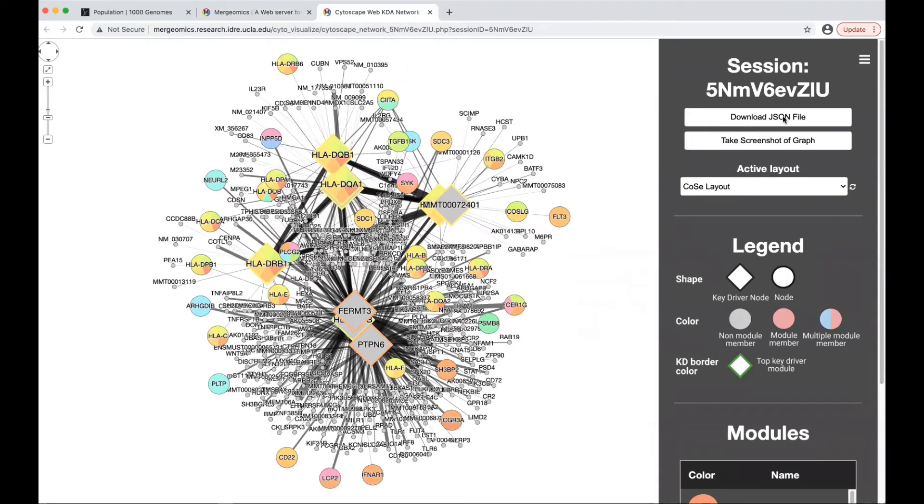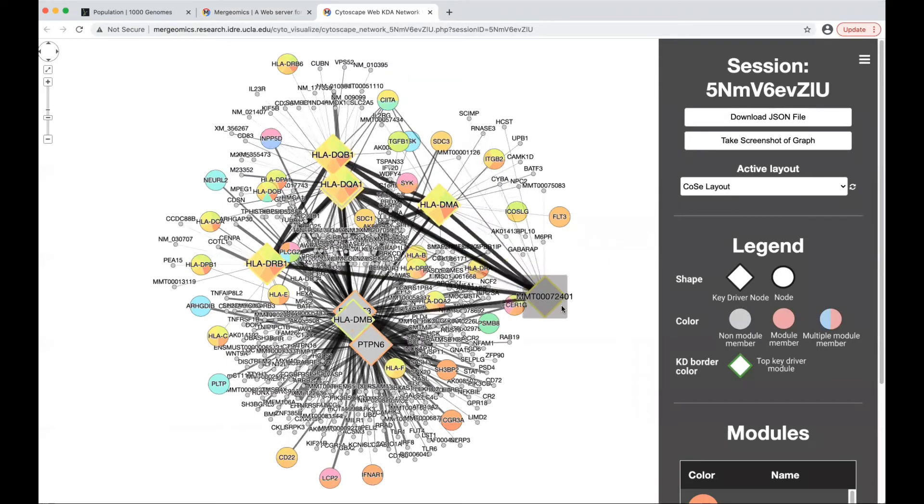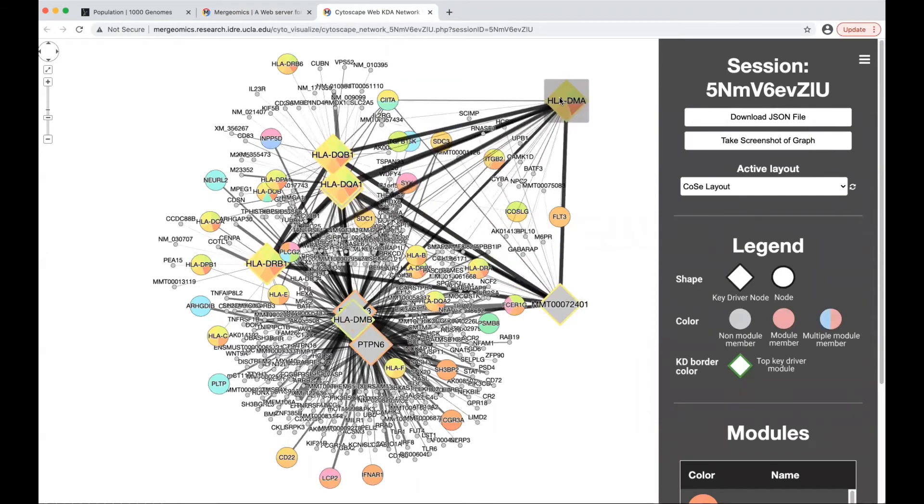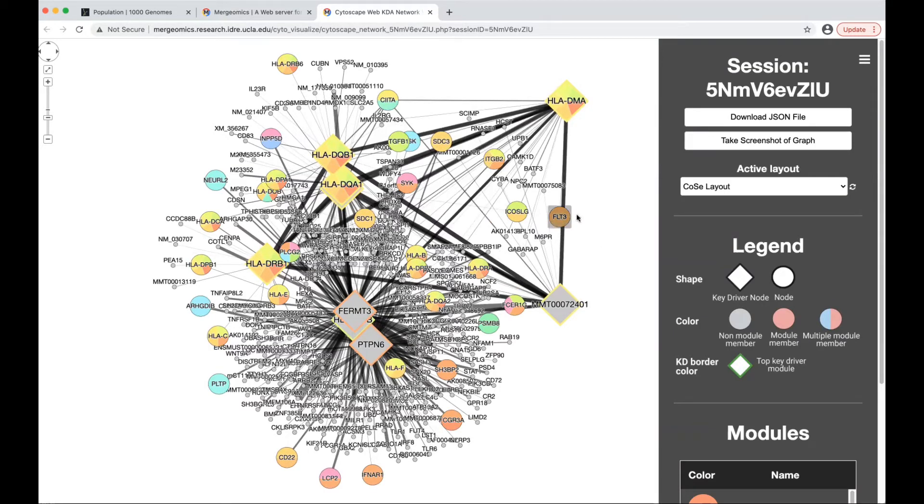This new tab will provide the visualization of your network. You'll have the ability to download the JSON file, take a screenshot of the graph, but you'll also have a legend here that will signify what each of these shapes and colors represent, where the diamond shape signifies a key driver node, and the circular shape represents just a given node.